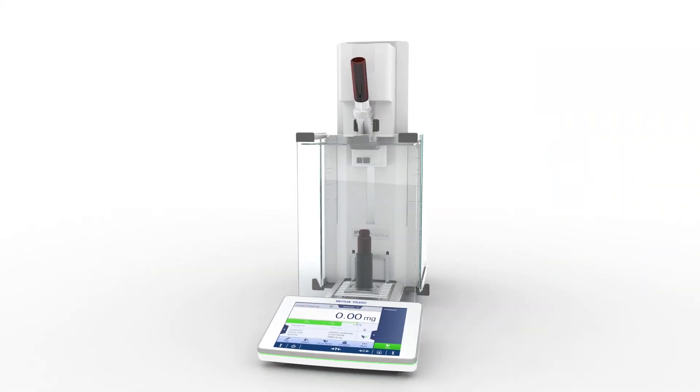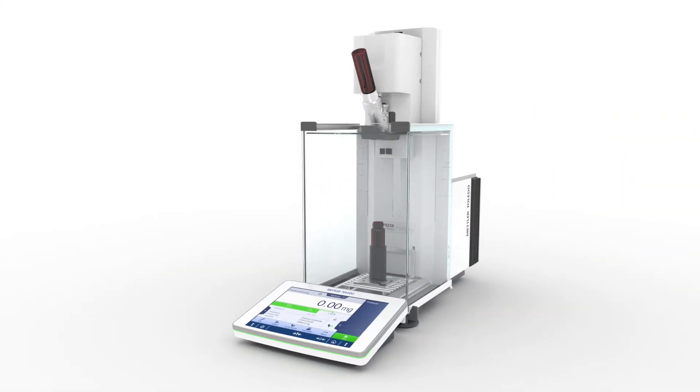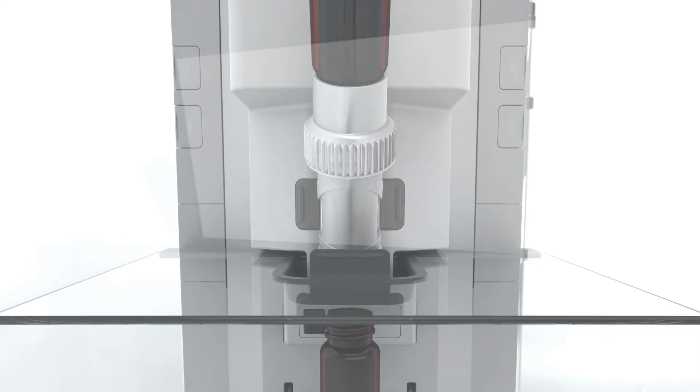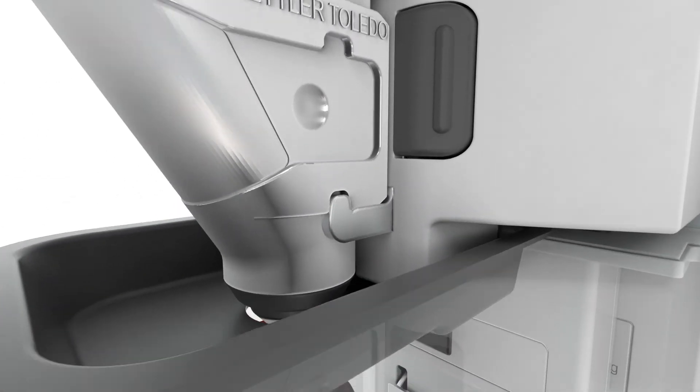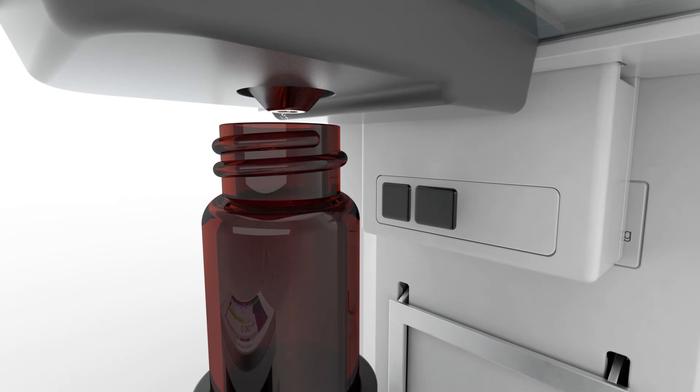Are you interested in solving all these problems in one go? Then consider the XPR automatic balance — a standalone solution for highly accurate, reproducible, and safe automated weighing of powders and liquids.